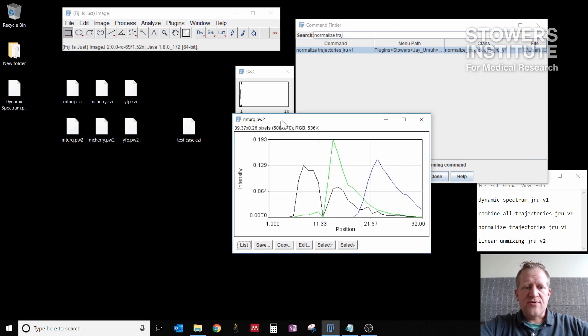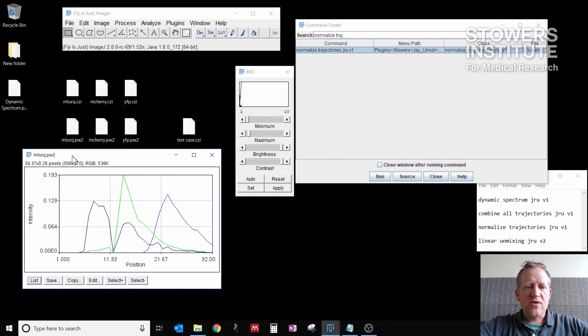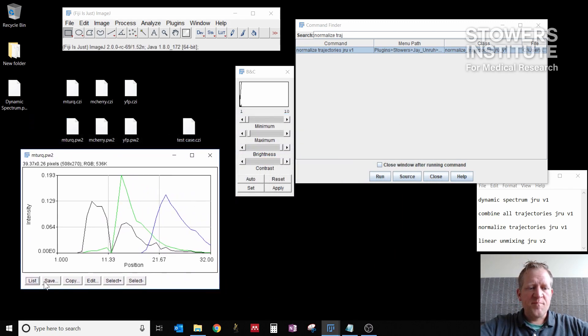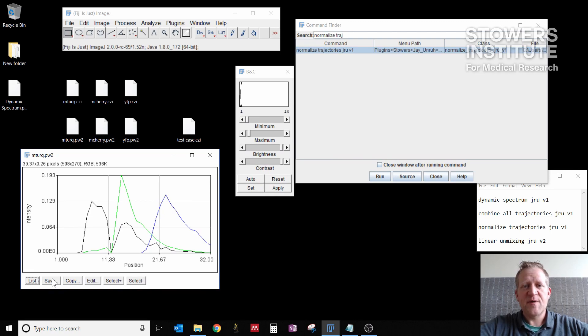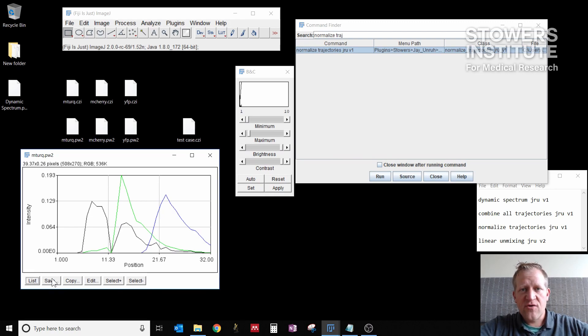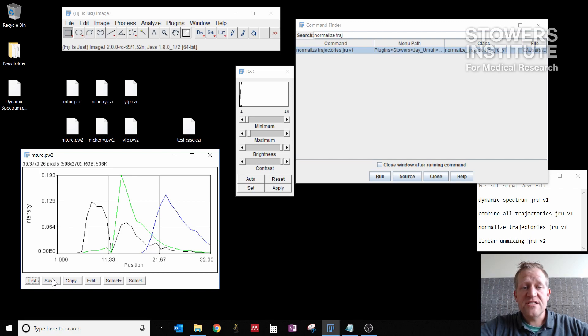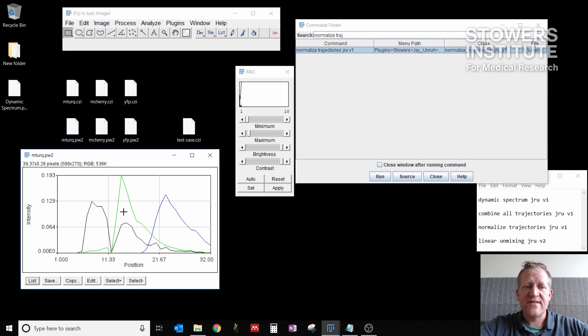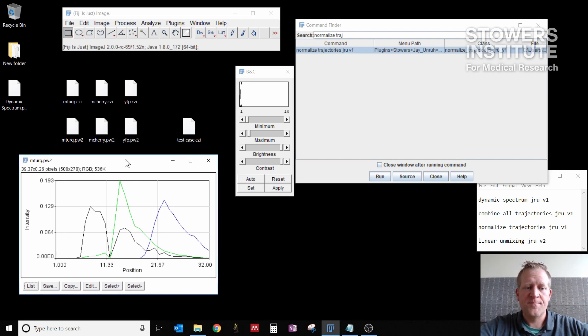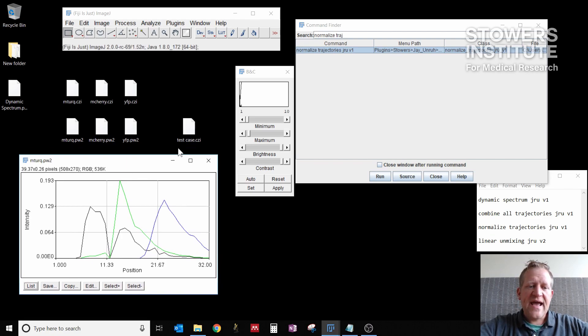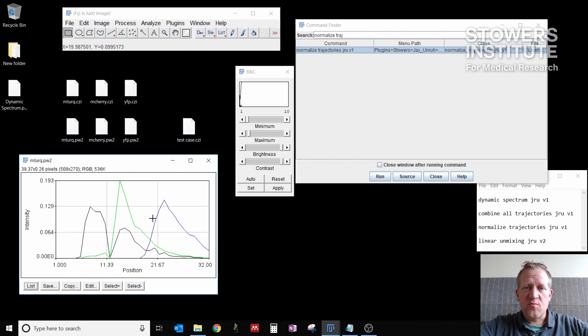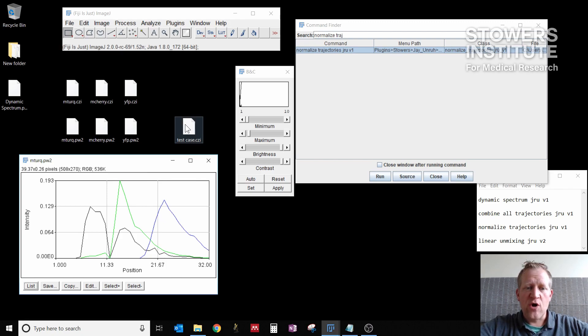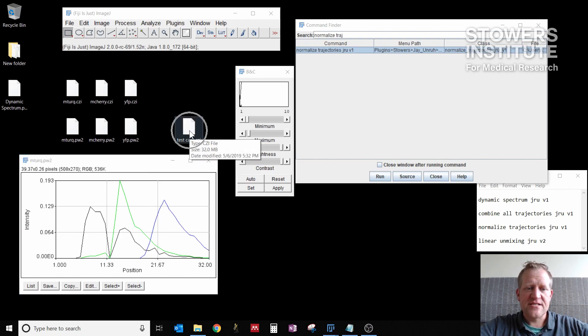So now this would be a really good plot window to save because for any experiment where you use the same objective with the same dichroic and filter settings, you can reuse these spectra to do unmixing later. So once you have good spectra for each of them, it's a good idea to go ahead and save these for batch processing later. So now that I have all three spectra in one window, I want to go ahead and open my test case image. That's this here.